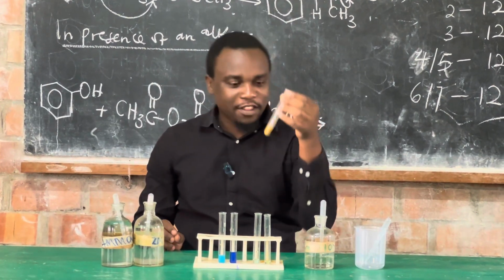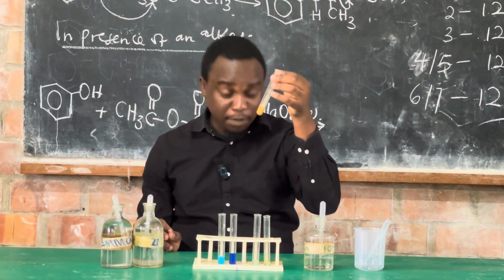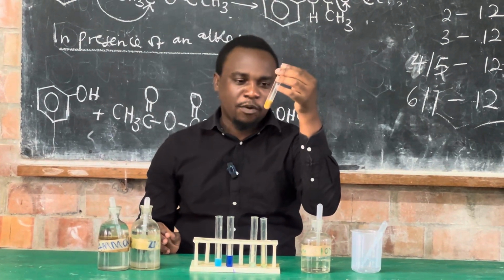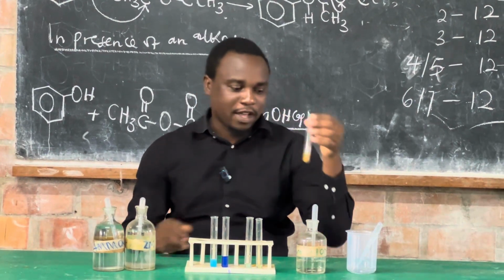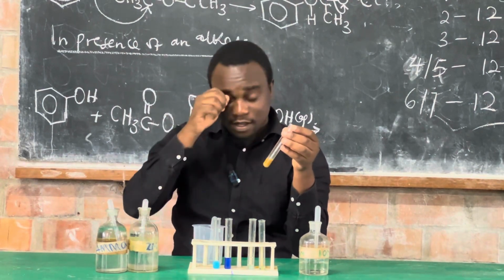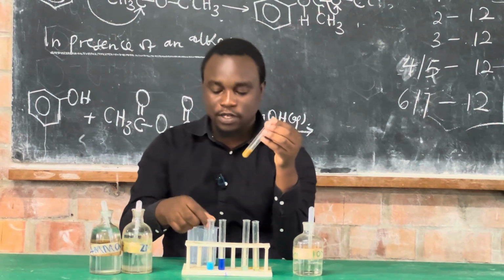The chemistry behind this is that we form iodine solution which is responsible for the brown solution we are seeing, or the brown color of this. However, the inside precipitate which is present is copper 1 iodide. We can confirm the presence of that by addition of sodium thiosulfate, which I am having in this beaker here. So I'm going to add sodium thiosulfate in this solution and we see what happens.